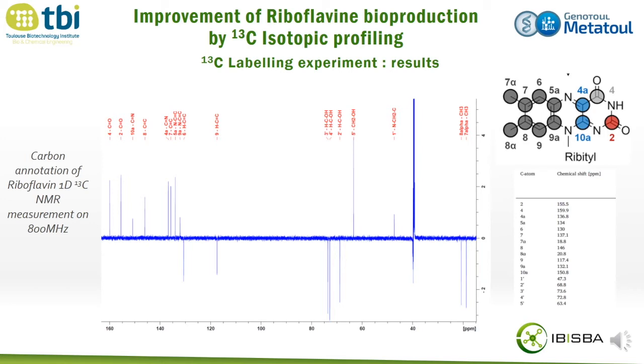Then we attributed each signal to one carbon of the molecule, and for the rest of the study, we will focus our analysis on the carbon 2, the carbon 4 alpha, and the carbon 10 alpha, between 130 and 160 ppm.